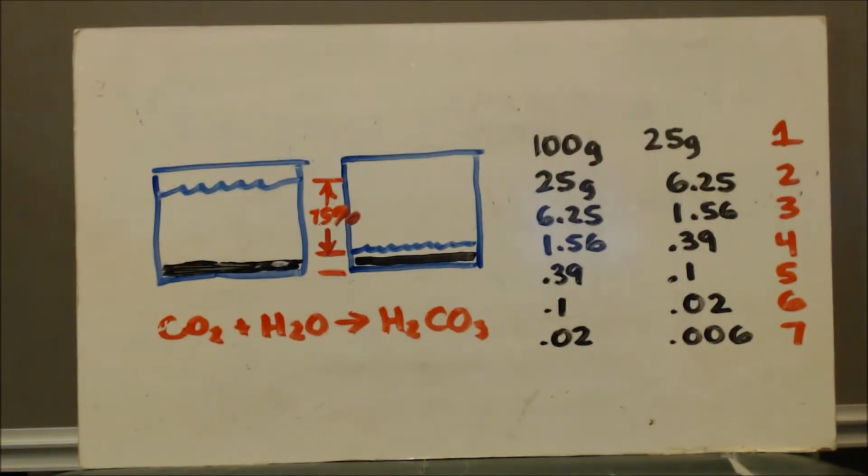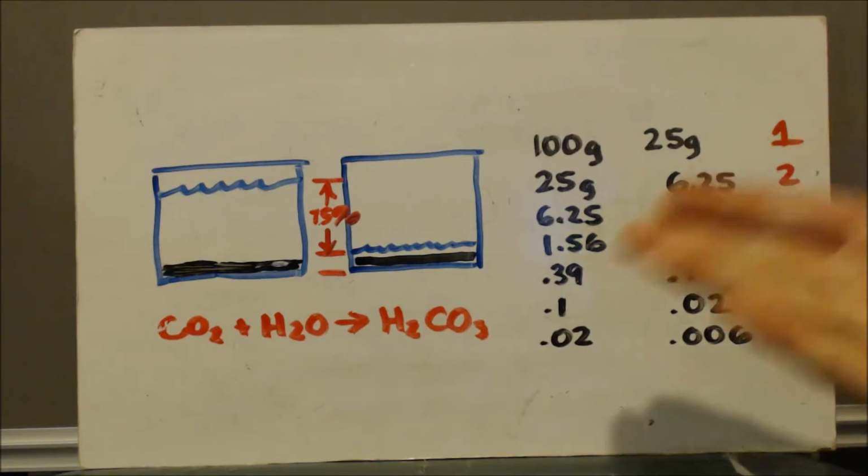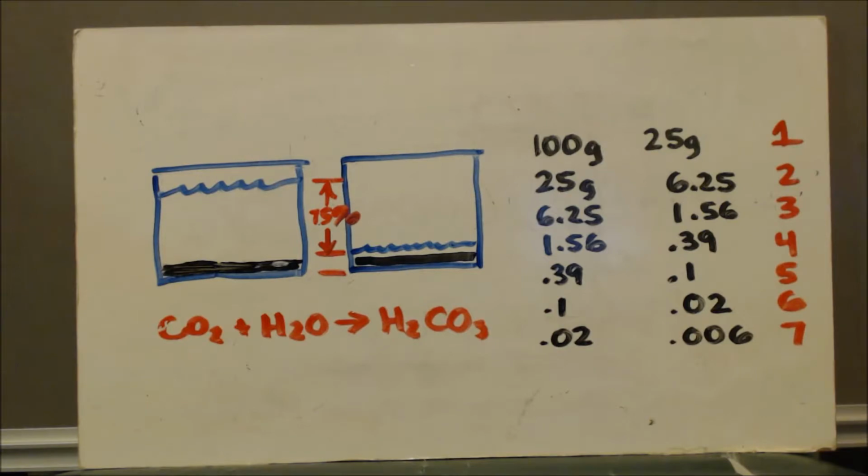But if you recall in that video, there's carbon dioxide in the water because it's in the air, right? And that forms carbonic acid, and that will change your hydroxide into a carbonate. Okay, so you can't really do that if you want to make a pure hydroxide.